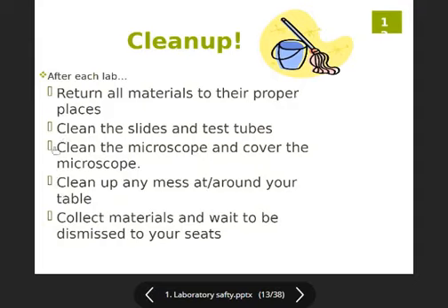A very important thing is when you are using the microscope. Very important thing is to cover the microscope and close the microscope. When you finish, close the microscope, turn it off, and cover it. So this is a very, very important thing to remember.